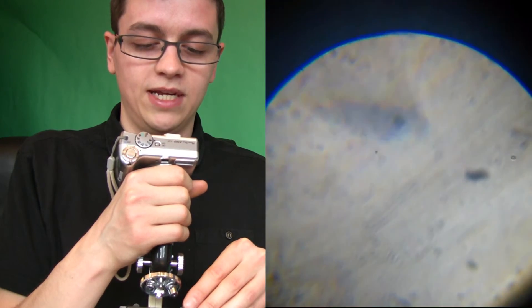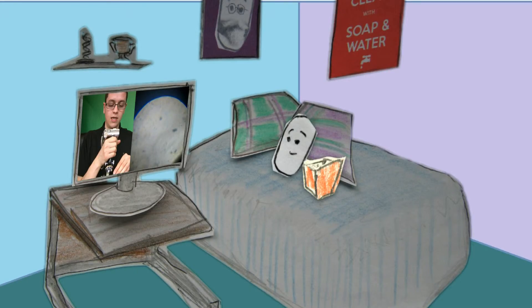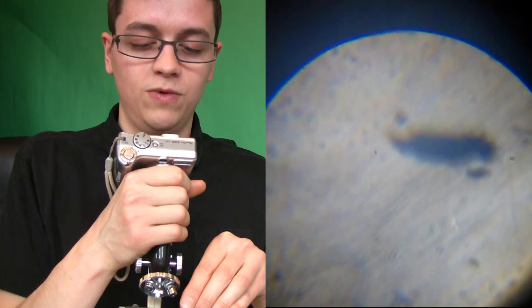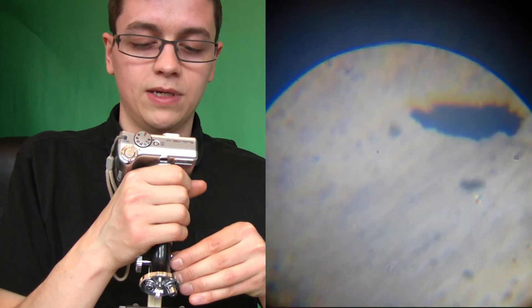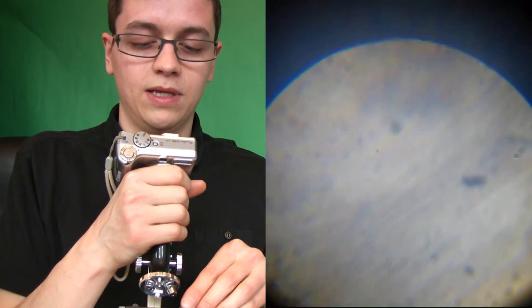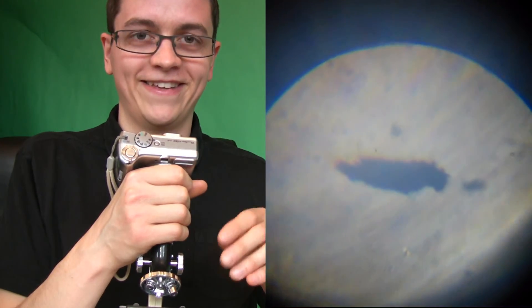So we're not actually looking at any animals or anything on here, this is just so interesting. But you can see I move the slide and I can focus. There we are. Cool, huh?